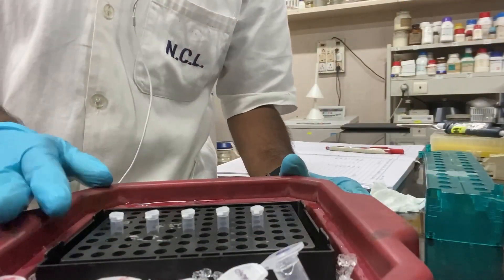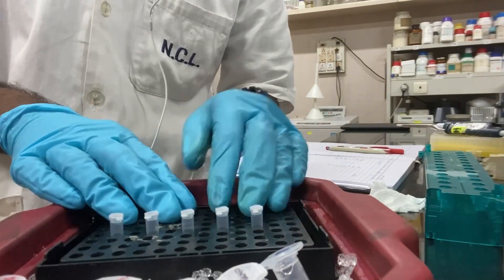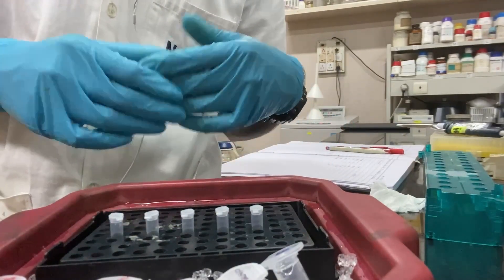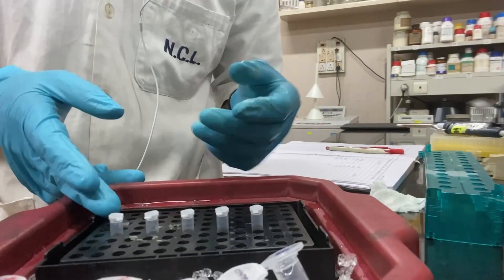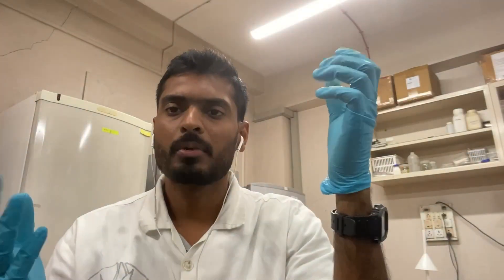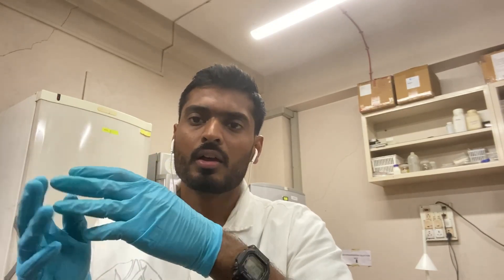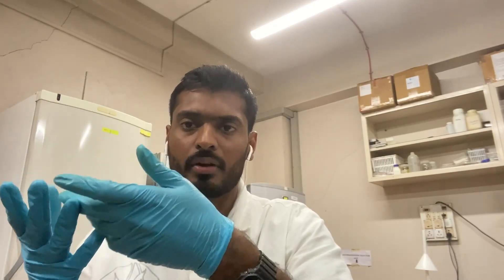Today we are going to prepare 5 reactions including one negative control reaction, and each reaction is 10 microliters, giving us a total volume of 50 microliters. This 50 microliter reaction can be called the PCR master mix, since we are using only one specific forward and reverse primer. In this case we want to amplify only one gene, but from different cDNAs.